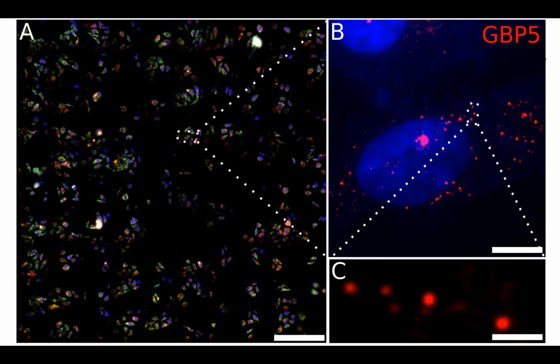So the total number, and if you zoom in to one individual image, you can see the nucleus as well as the RNA molecules, the red dots over here. So this is really a data intensive project and experiments.